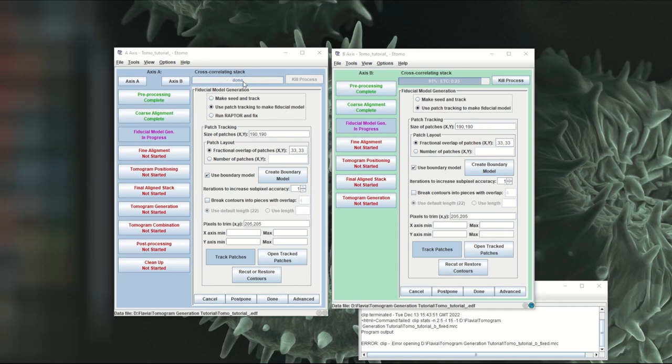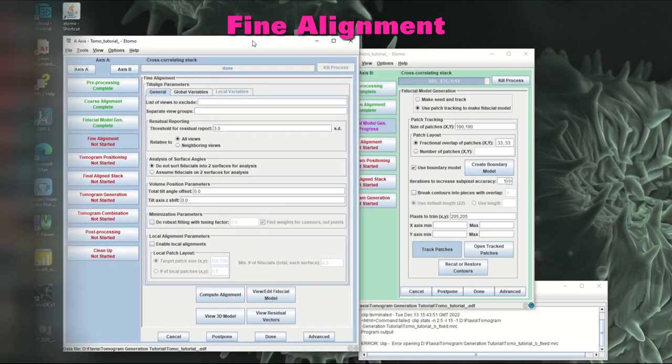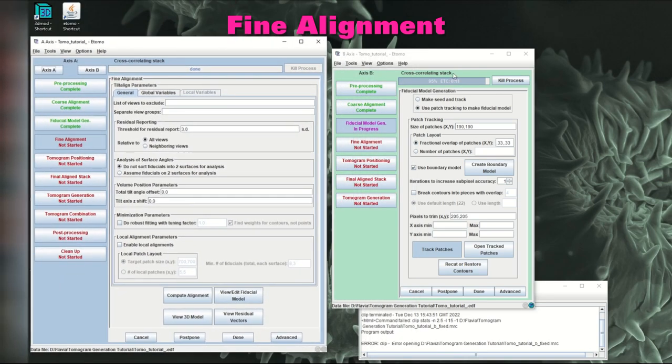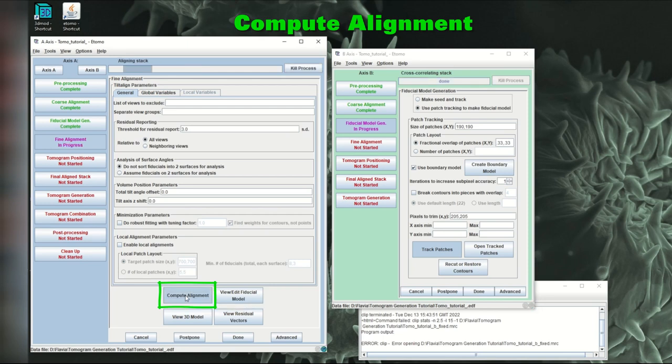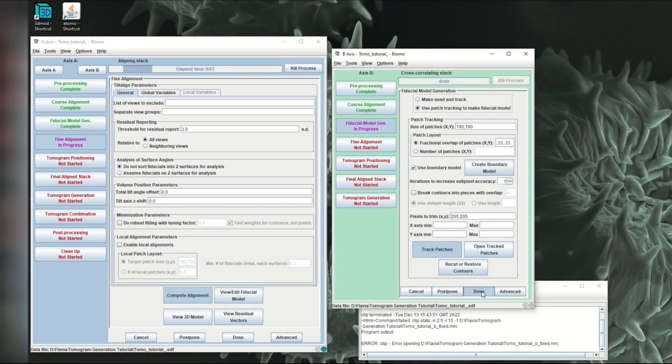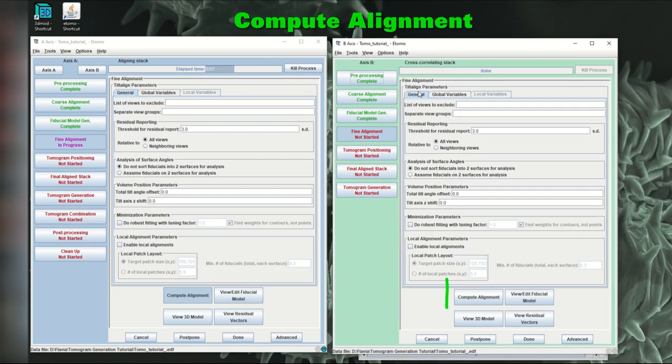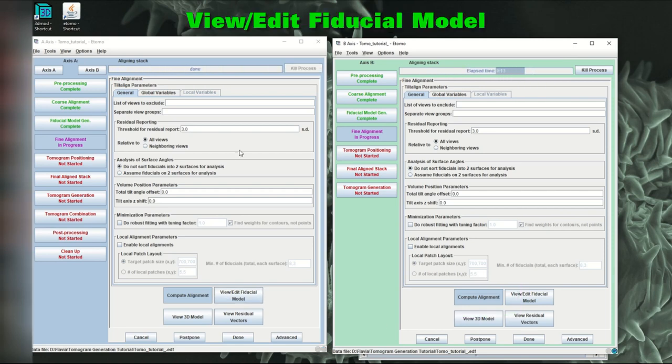And then go to track patches and track patches here as well. So now it's finished tracking patches and we can click done on this axis. And then after that, click on compute alignment for this axis. And now it's done on the B axis as well. We can click on done and compute alignment for the B axis.